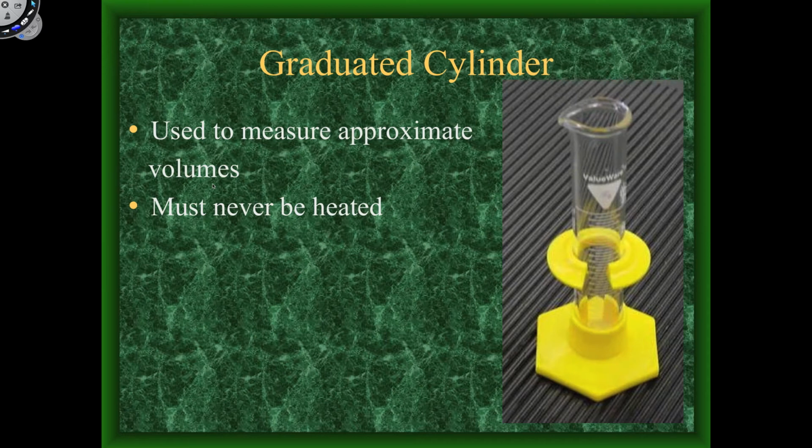So they are used to measure approximate volumes. That's what you need to know. Well, there are other items to measure volumes that we'll get to later, but the graduated cylinder is the most common for measuring volume.